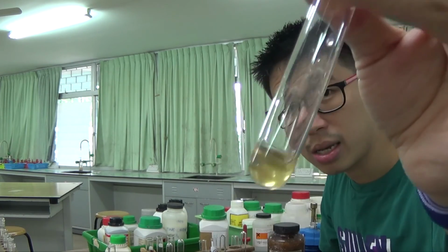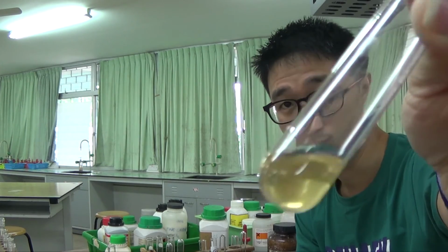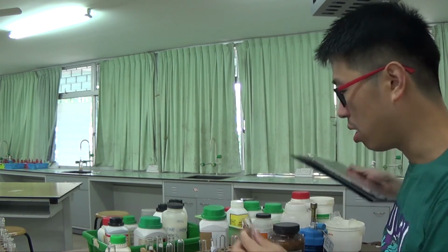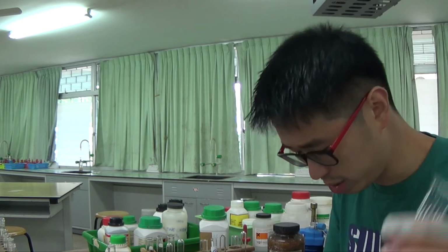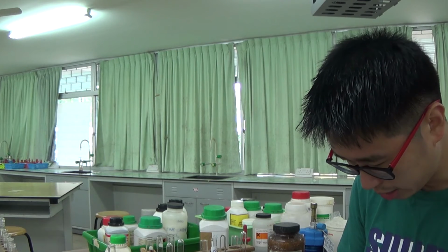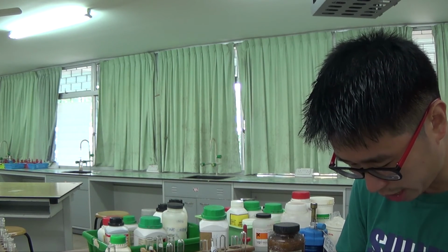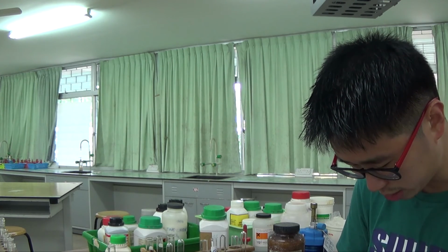So this one is the solution. This is iron 3+ solution in water. Be careful. A lot of students are always confused. If you look, this is iron 3+ aqueous. So now we have Fe3+ aqueous, we also have NH4+ aqueous, and we also have SO4 2- aqueous.